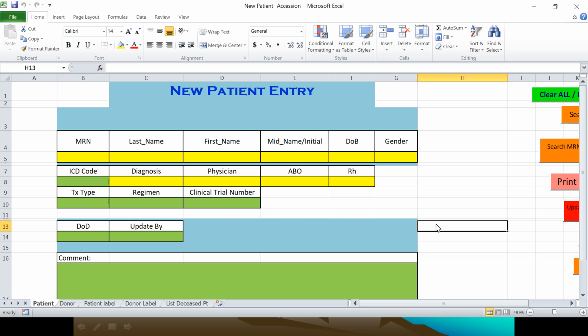And to make work easier for fixed options, it's better to make a drop-down list, such as gender. If you can make a drop-down list for the future, you can easily choose from it. How to make this drop-down list is also very simple. Let's see here.